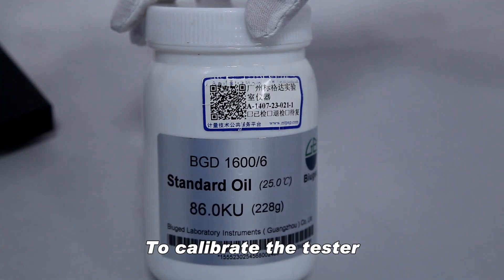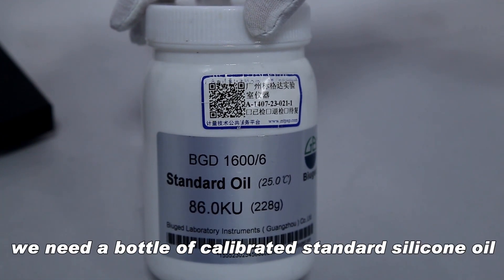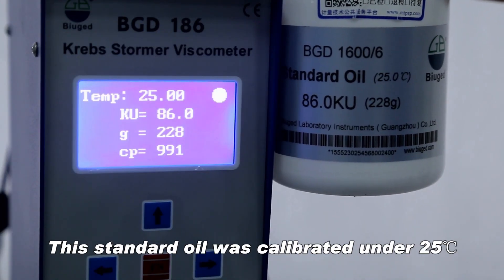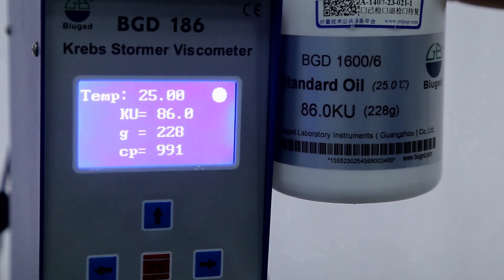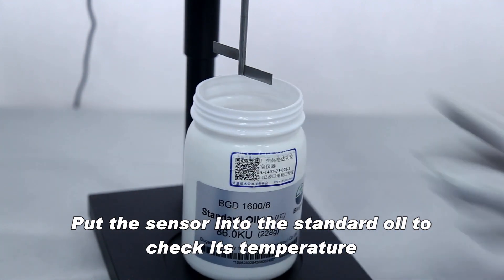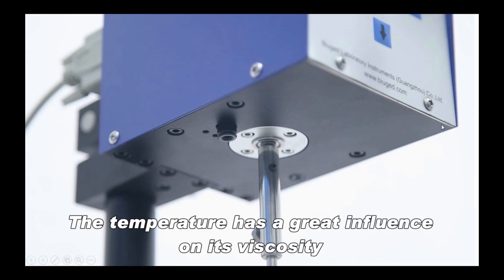To calibrate the tester, we need a bottle of calibrated standard silicone oil. This standard oil was calibrated under 25 degrees Celsius with a viscosity of 86.0 KU or 228 grams. Put the sensor into the standard oil to check its temperature and make sure the sample is 25 degrees Celsius.